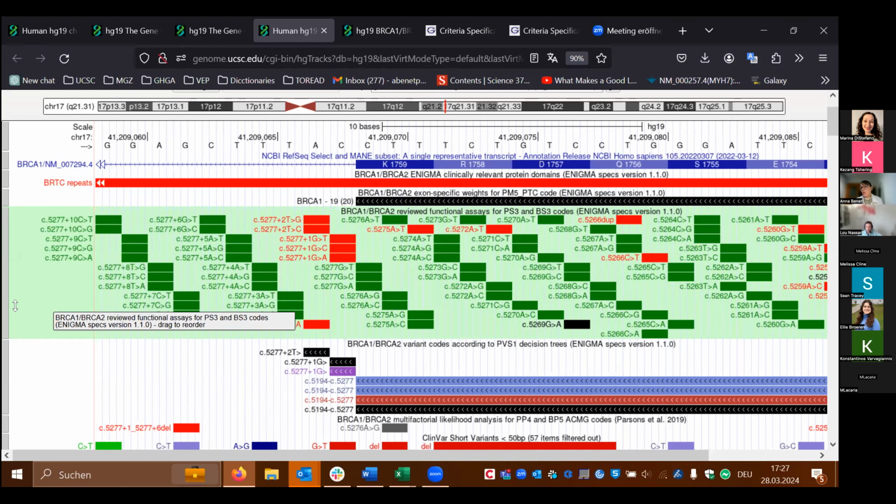So my question here is two. One is, are we able to search by that tag? So for instance, that evidence code, if we were to put in BRCA or put in a gene with that evidence code, would it pull us to, let's say, a variant, or how could we practically use it in the browser to search? Is that a possibility?